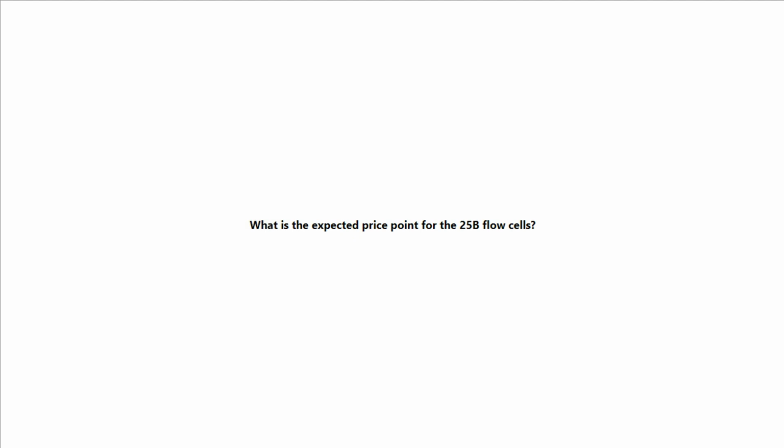So I see another one. For the X Plus, can I load the second run while the first run is still running, or do I have to wait till the first run is done? Great question. Currently Stagger is not enabled. So as it is right now, you would need to load both runs at the same time, but they could be different flow cell types.